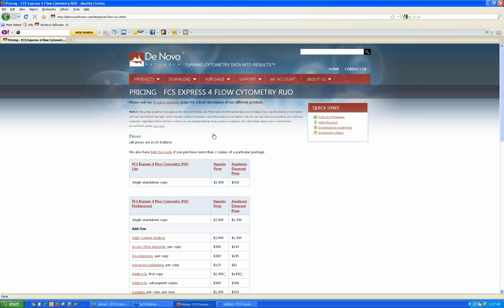We've run all of our validation and could technically release at this moment, but at this point there are thousands, if not tens of thousands of patients a week whose data is being analyzed with FCS Express, so we're very, very cognizant that the clinical version has to be perfect, and we are delaying that a little bit just to make sure that there are no unexpected surprises.